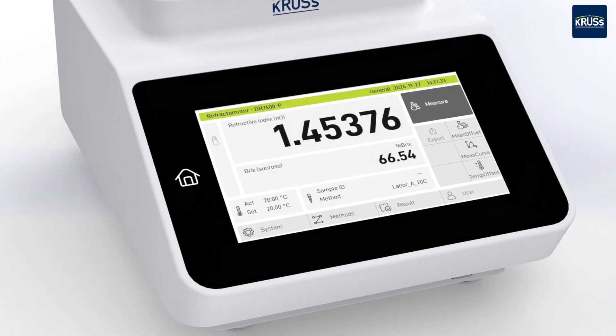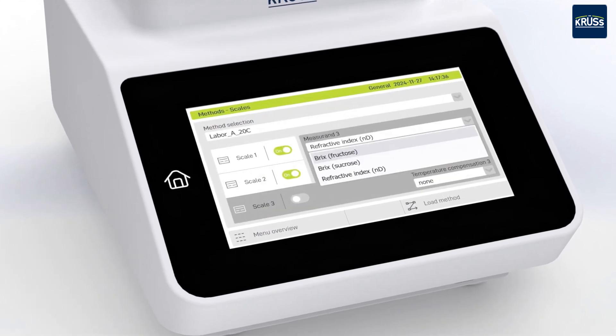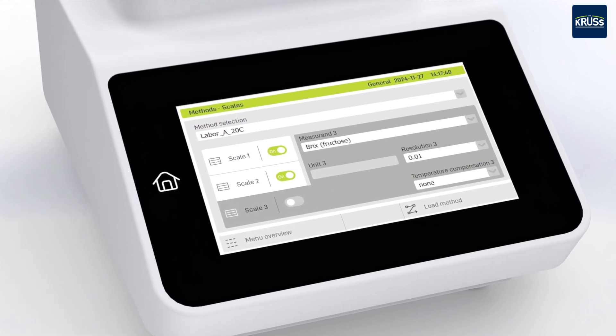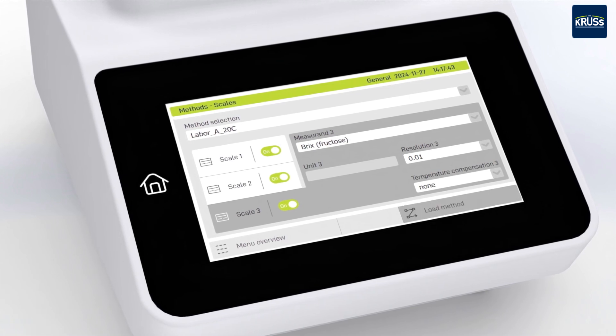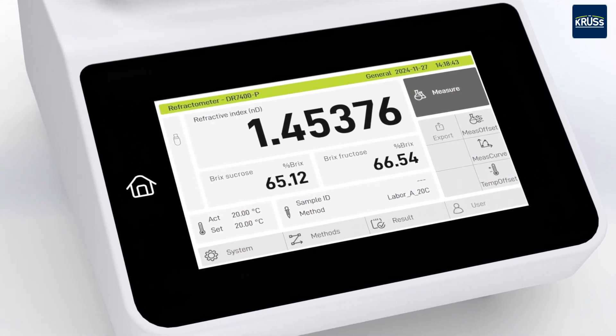In addition to the pre-installed refractive index and Brix scales, a variety of additional scales is available on request. User-configured automated conversion to any measurement variables and scales is also possible. Up to three scales can be displayed simultaneously.